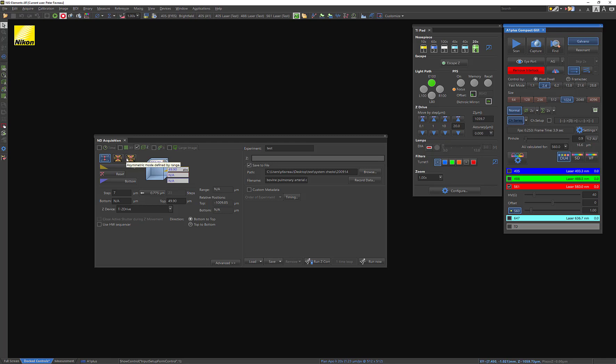There's an asymmetric method too, where you can basically say, if you want your top half to be larger than your bottom half, or vice versa, this is good for that. But generally speaking, most people are going to choose the defined by top and bottom. It's very rare that someone would probably want to do the symmetrical or asymmetrical, unless you had a very specific experiment with a Z series that you were interested in performing.